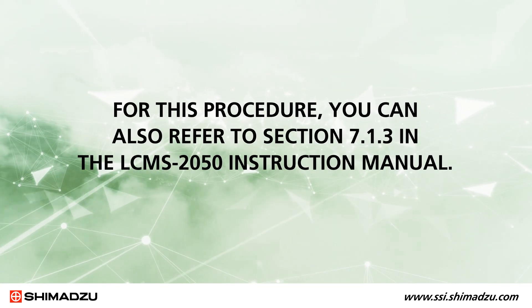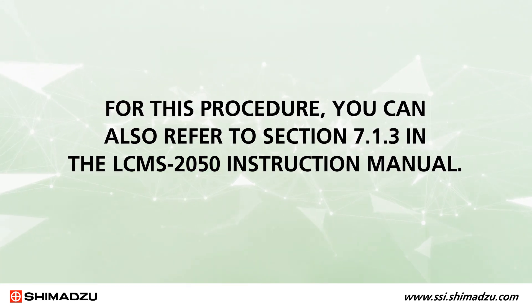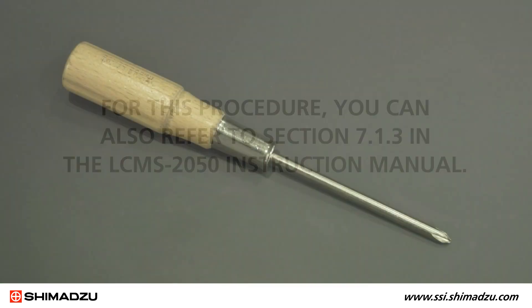For this procedure, you can also refer to section 7.1.3 in the LC-MS 2050 instruction manual. The only tool you will need is a Phillips head screwdriver.